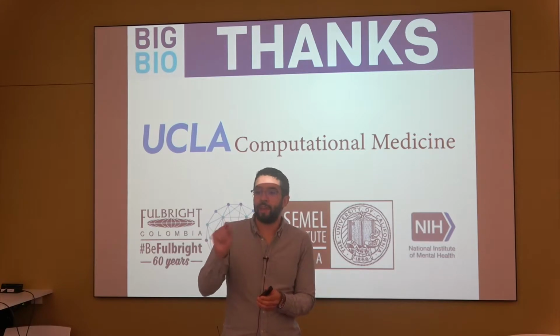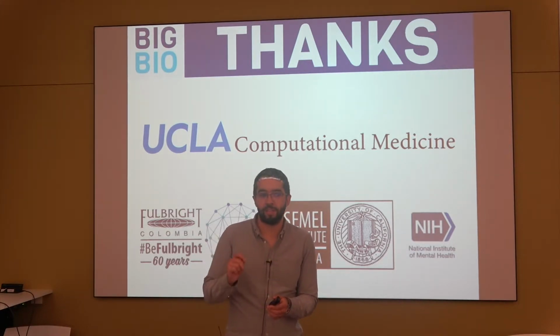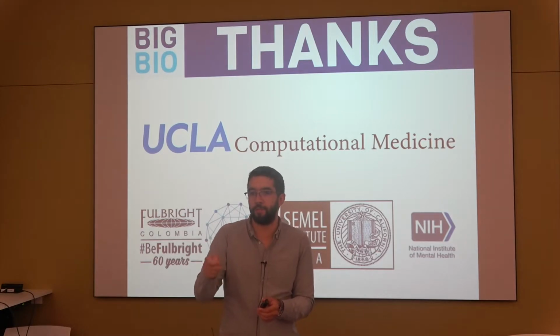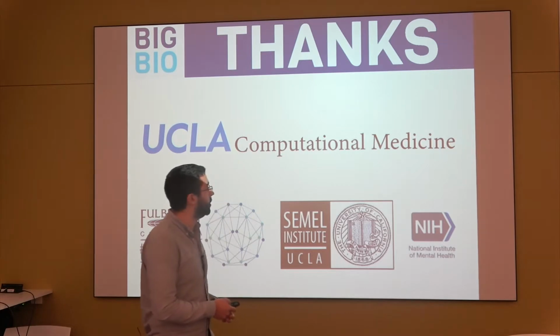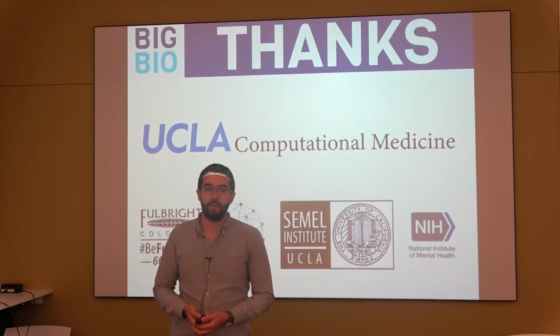Exactly. When the image segmentation takes place and the machine assigns one of the 4 bases as the highest probability base, it's also saying how confident it is that the base it's calling is actually there. Is it based on the intensity of fluorescence?